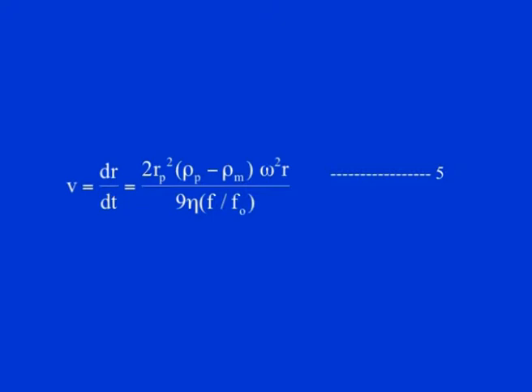So, this has to be taken into account, and where this difference has to be taken for will depend on the particular kind of molecule, or particular unhydrated, hydrated and spherical molecule, and all these factors have to be taken into account. Now from the equations it is very clear that the sedimentation rate of a particle is dependent on many factors. One is that it is directly proportional to the size of the particle, where I was telling you the radius Rp of the particle.